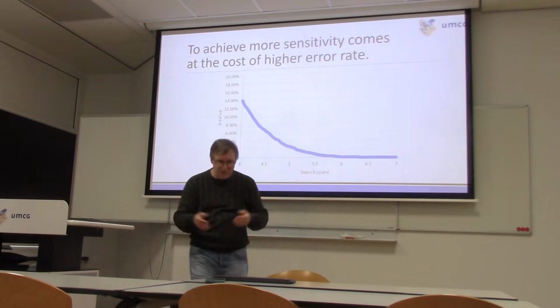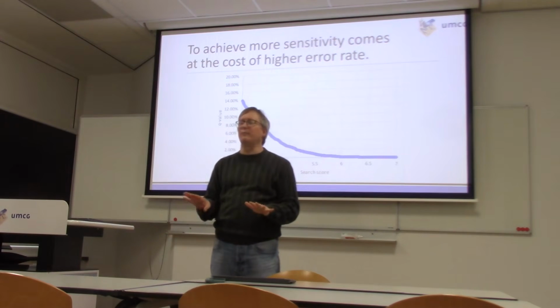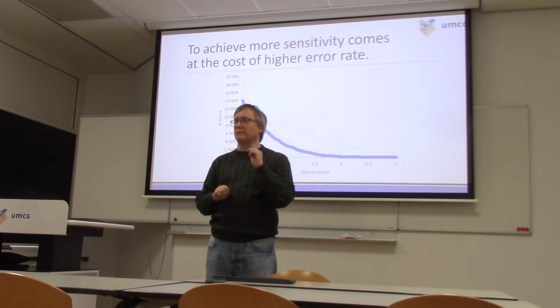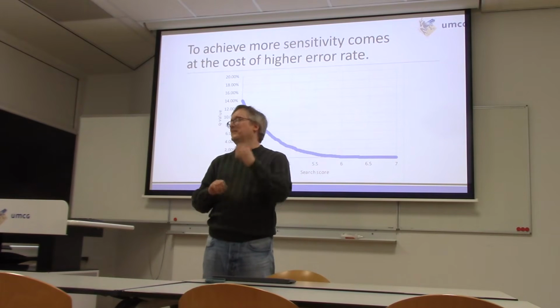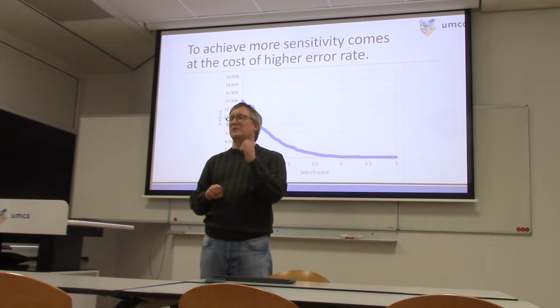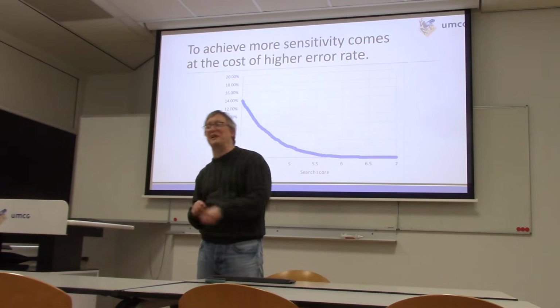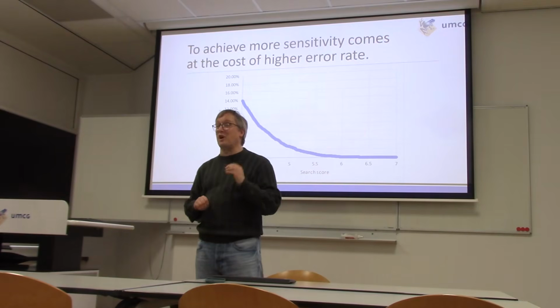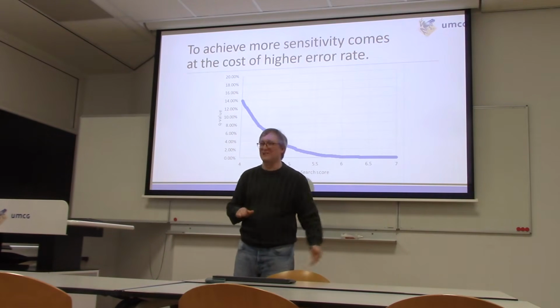So, I'm going to talk about an uncomfortable reality for just a moment. In proteomics, the PI who is running the show always wants the longest protein list possible. There's not a PI alive who doesn't want to say, I identified 5,000 proteins rather than 2,000 proteins. So there's always pressure in proteomics to give the big number. Number go up is good.